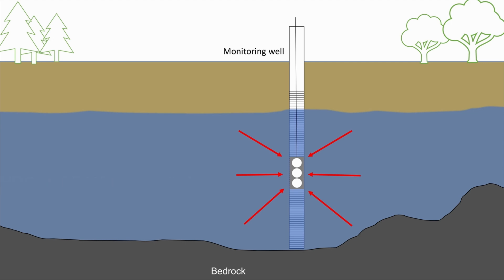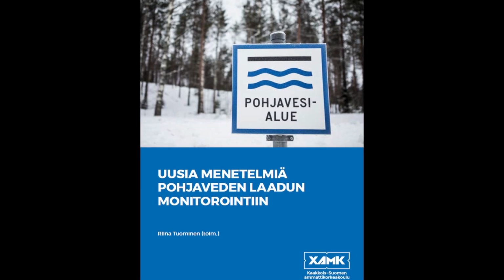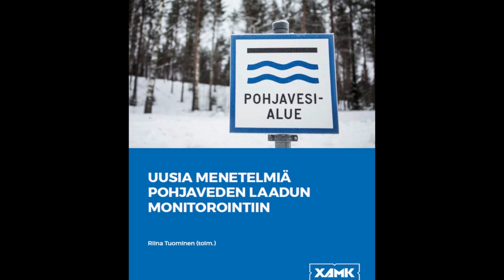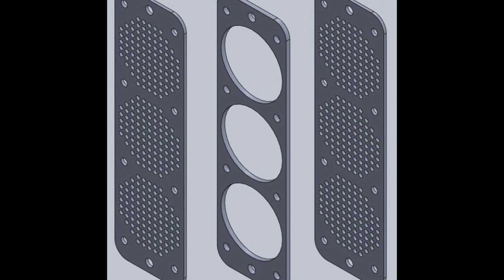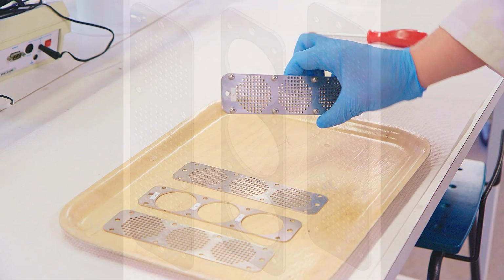The project, entitled New Innovative Methods for Groundwater Quality Monitoring, UMO, in the Southeastern Finland University of Applied Sciences, developed an integrative passive sampler for chlorophenols, which is demonstrated in this video. Various types of passive samplers are also commercially available.